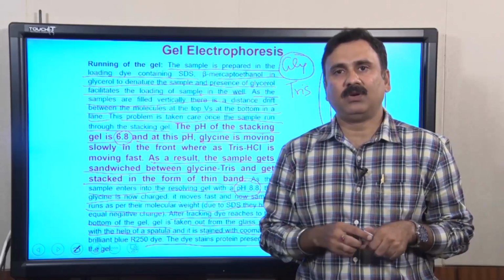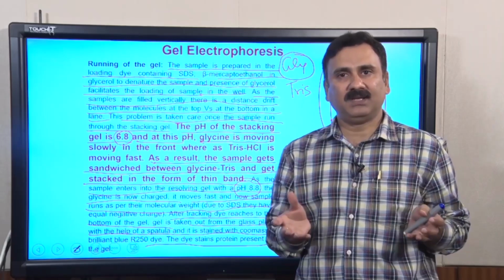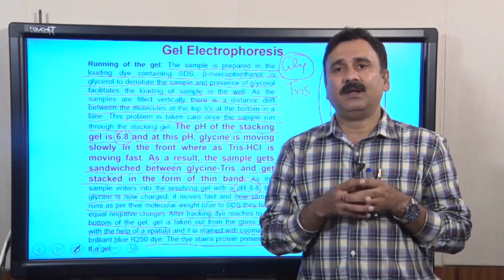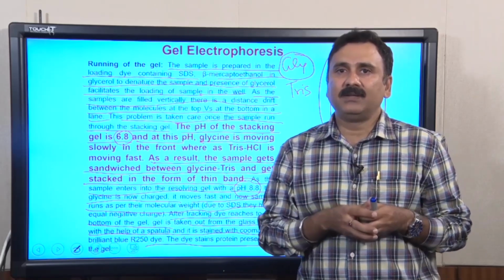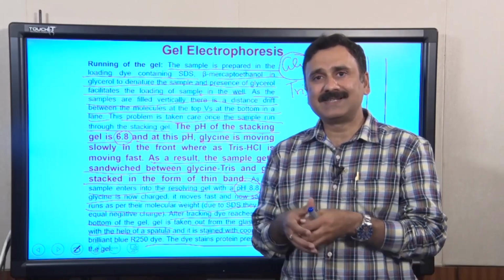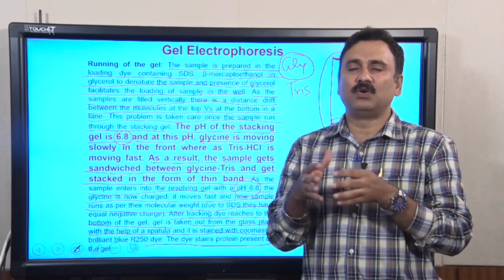So in this particular demo, Banish and my lab students have discussed how to run SDS page, how to prepare the gels, how to cast the gels, how to run the gel and analyze the samples, and at the end they have also discussed the different precautions you should take while you are running the protein onto polyacrylamide gels. And I hope these videos or the demo would be beneficial for you to advance your work.